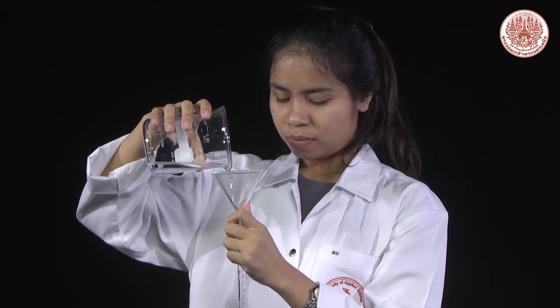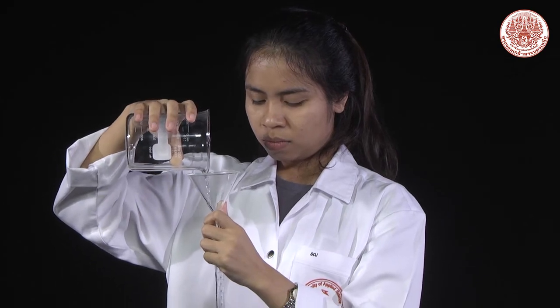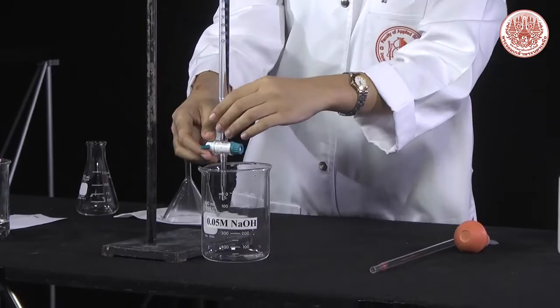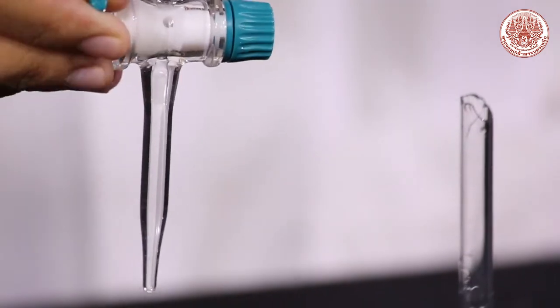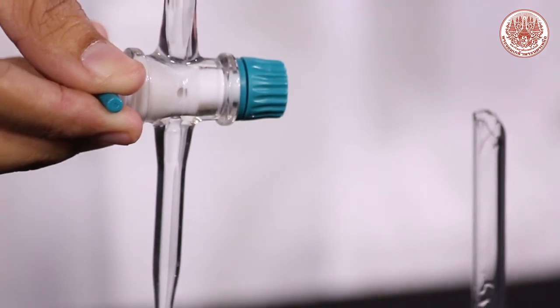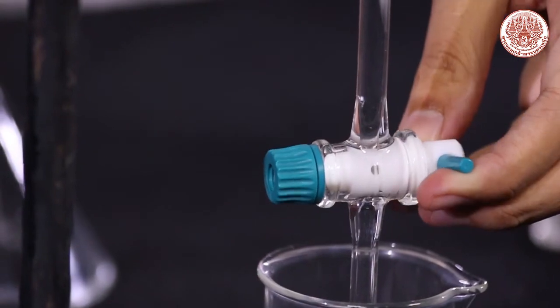Fill sodium hydroxide solution into the burette, assisted with a clean funnel. Mount the burette vertically by a burette clamp to a stand. Open the stopcock to fill the solution in the burette tip. If an air bubble is trapped in the tip, remove it by opening the stopcock completely several times. Adjust the volume to the desired mark. So the sodium hydroxide solution is ready to perform titration.